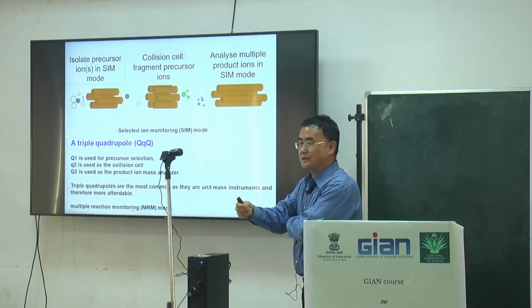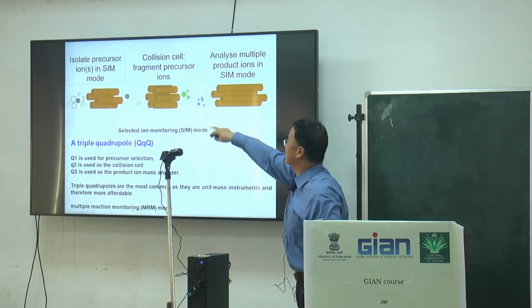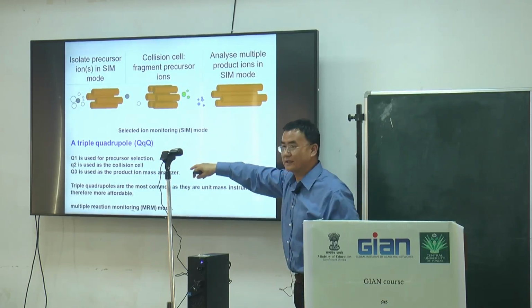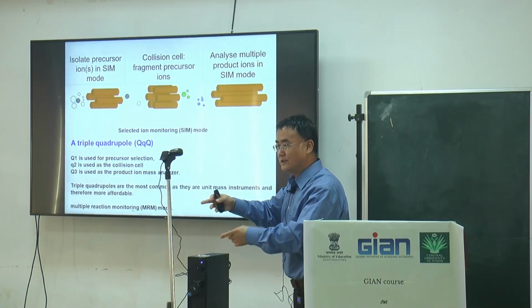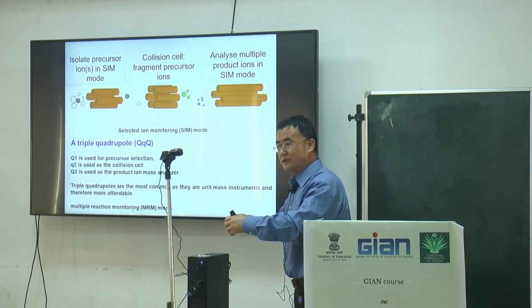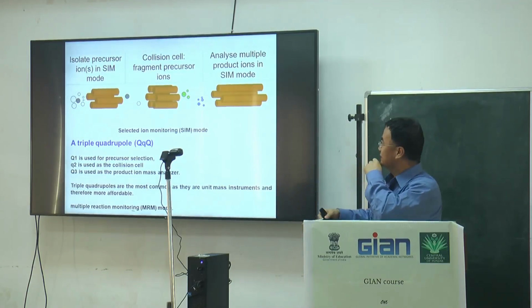Then we use those standards to do the same way. We get the signal with the same retention time. Then in our sample, we also observe the 700 molecule, so we can take that.